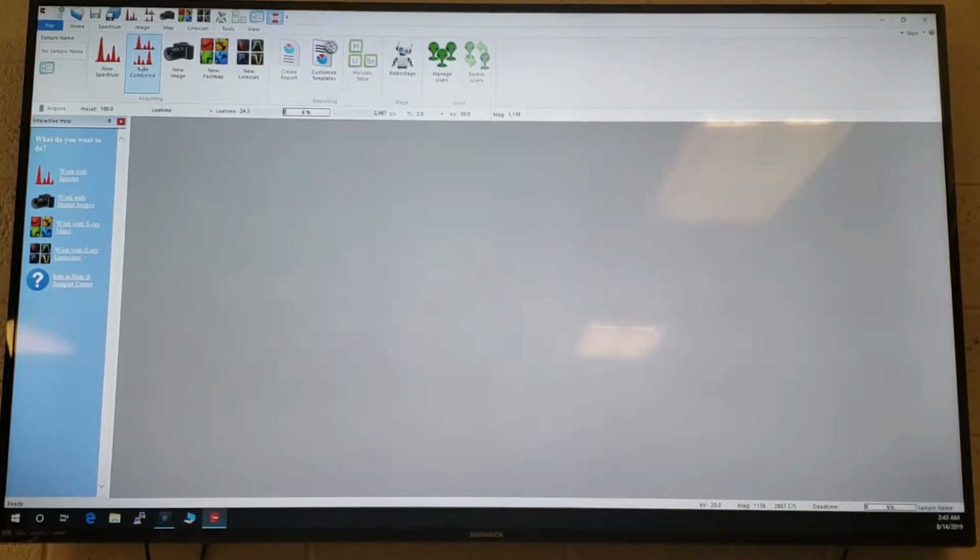IXRF makes another source, which we can shut off the E-beam, and we don't pick up any background as far as secondary and primary electrons. And we can do trace forensic on 1 ppm of something just using true XRF. What would you do? Put like a cobalt source in there or something? Yeah, we have a cobalt source, we have silver sources, we have all sorts of sources.